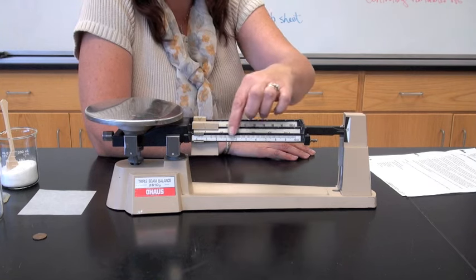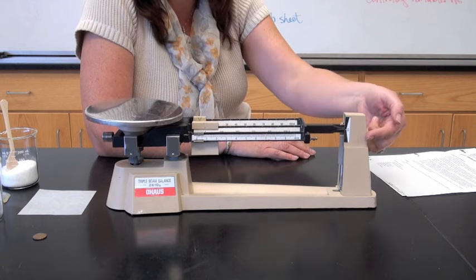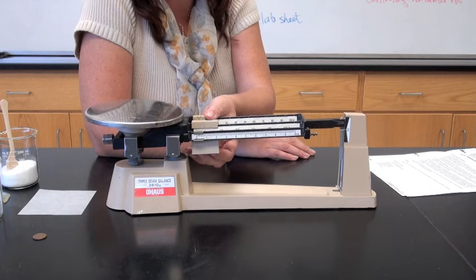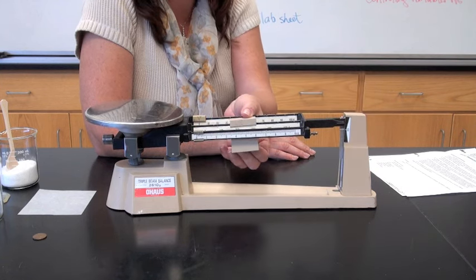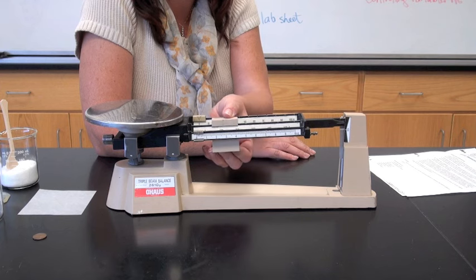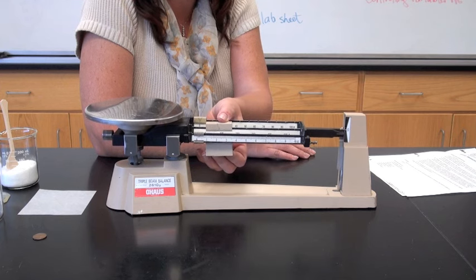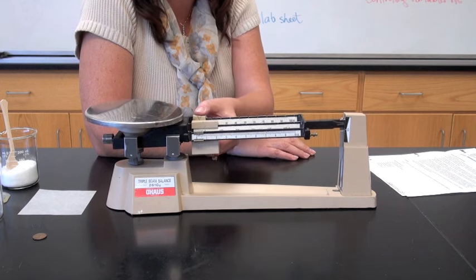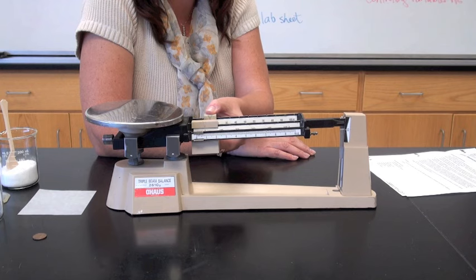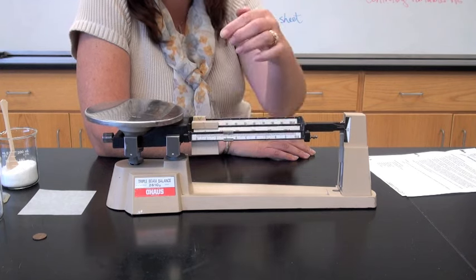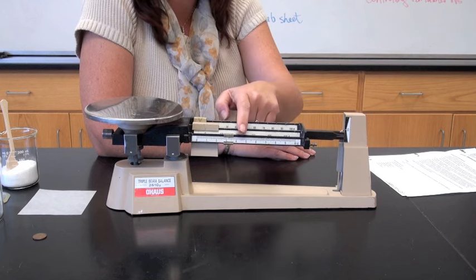The pan, the beam, the zero marker, and the riders. The riders are in different increments. The largest one measures in a hundred grams, the medium-sized one in the back measures in increments of ten grams, and the smallest one in the front measures in increments of a tenth of a gram.